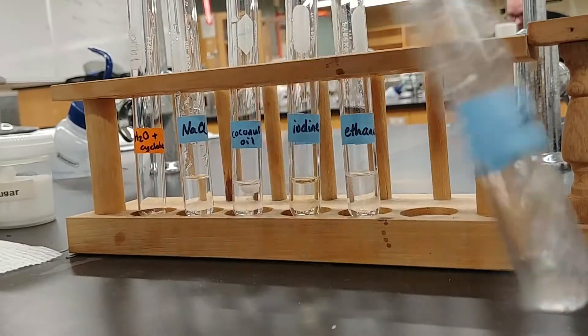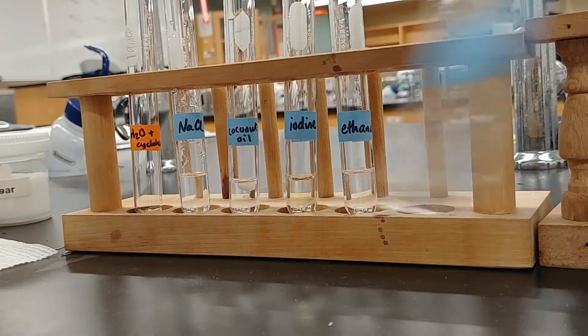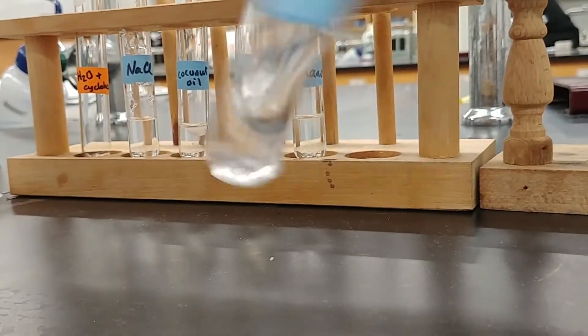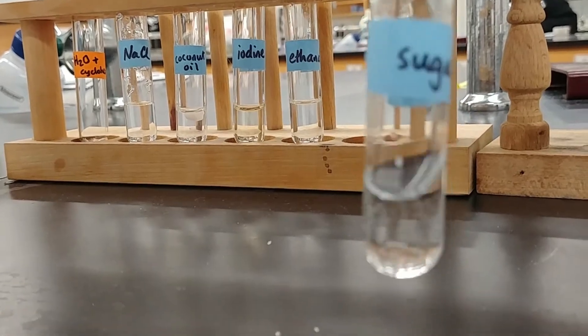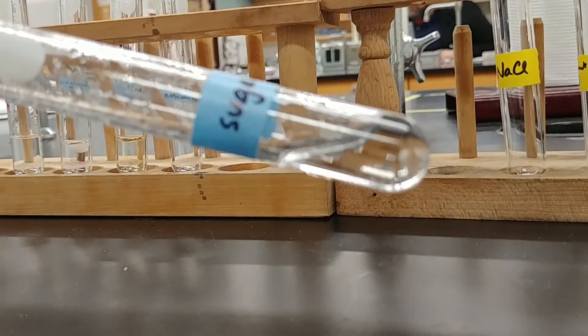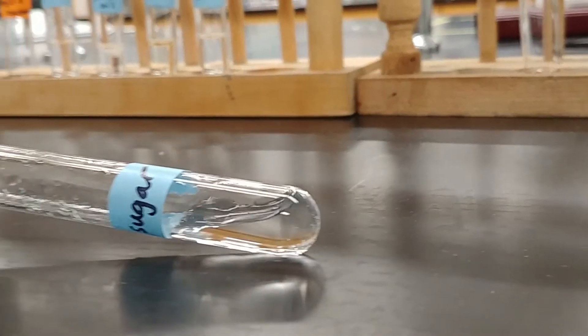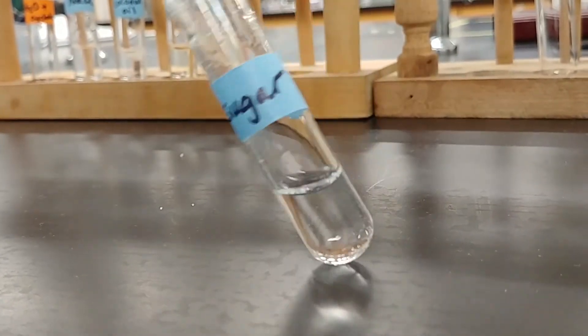And then finally, we have sugar, good old sucrose. Let's mix this vigorously, just like we did the salt. Let's see what we have. And be sure to compare this to what we saw in the beginning. In the beginning, we had small amounts of the solid in each of these test tubes.